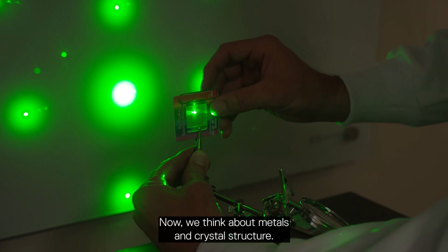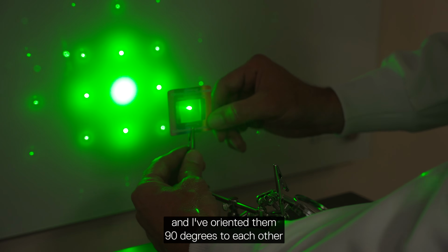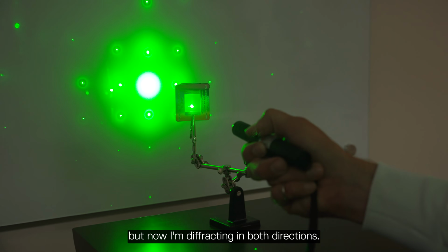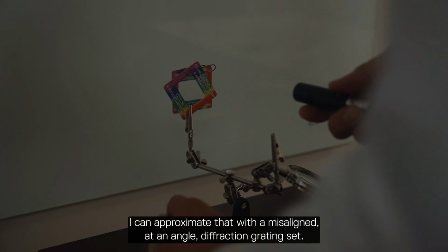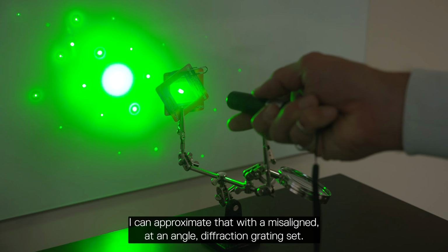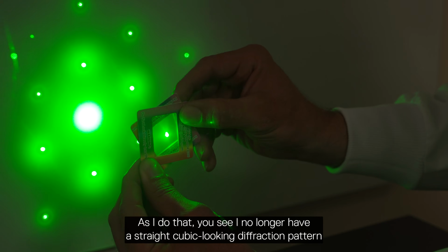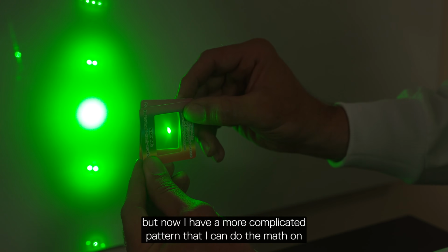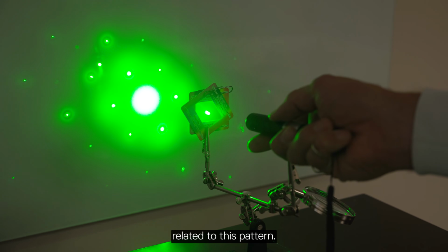Now we think about metals and crystal structure. What I've done here is I've taken two diffraction gratings and oriented them 90 degrees to each other, and we begin to get what looks like a cubic pattern. You can see again the incident beam down the center, but now I'm diffracting in both directions. If I get into the more complicated world, I can approximate that with a diffraction grating set misaligned at an angle. As I do that, I no longer have a straight cubic-looking diffraction pattern, but a more complicated pattern that I can do the math on to figure out how those planes are oriented to each other and the distances related to this pattern.